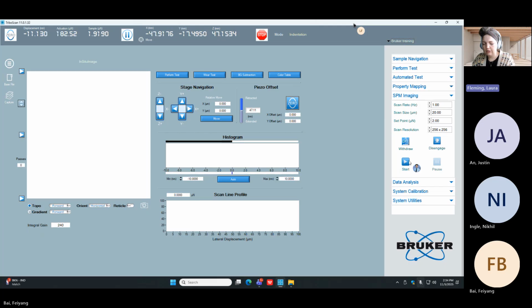We can tell in one very big way. Up in the upper left-hand corner, do you see where the sample force is? Further, like the far upper left. Up at the top here, there's this ribbon where we get the sample force that we were looking at earlier, because we were discussing how it should be 0 when it's in air. Well, now it's hovering around 2 because we're in contact with the sample surface at 2 micronewtons.